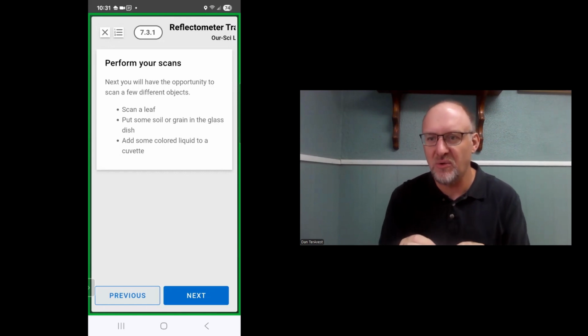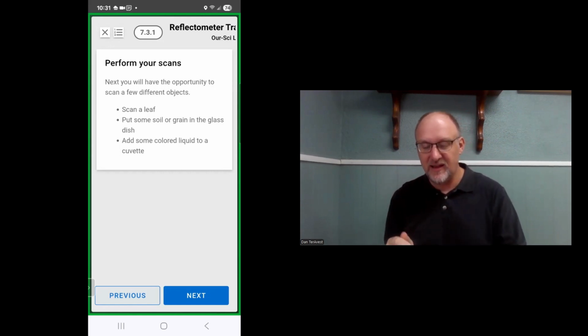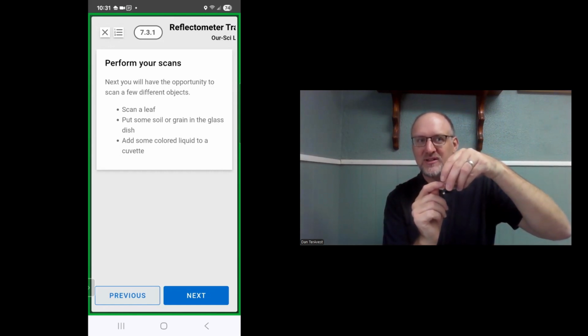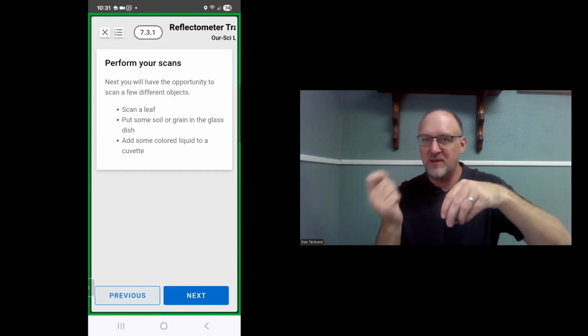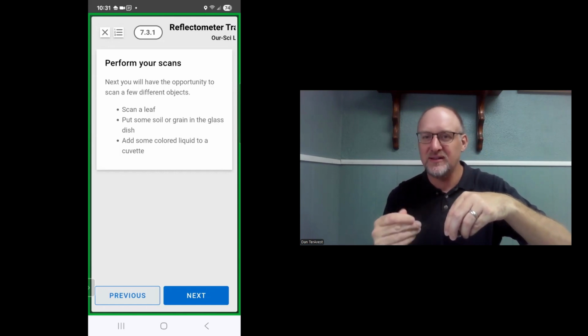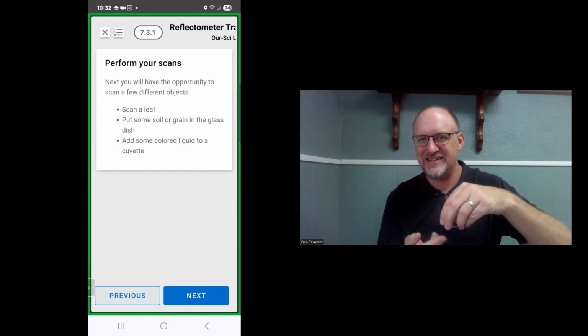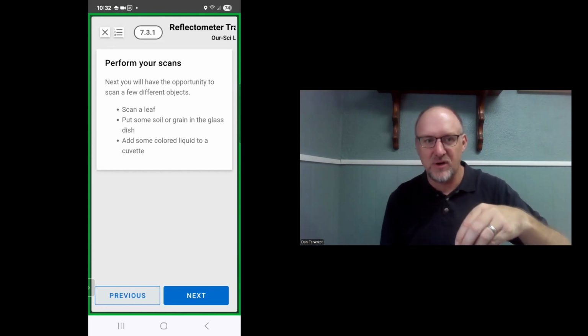That will also influence your measurement as well. So wherever possible, maybe you can tap the soil a little bit, try to remove some of the big aggregate, try to break it up a little bit so it's better homogenized, and then put it back in the soil dish so you have a nice consistent matrix at the bottom.